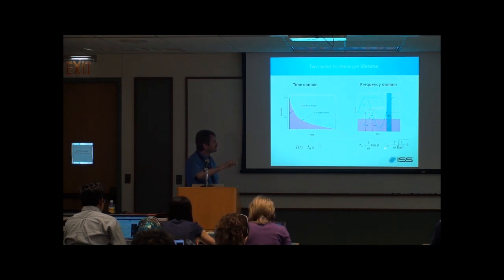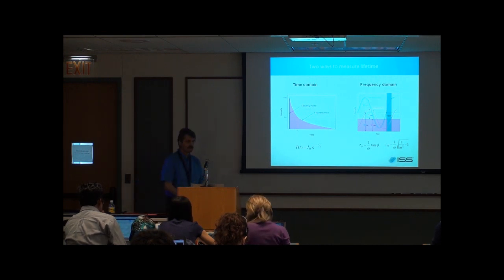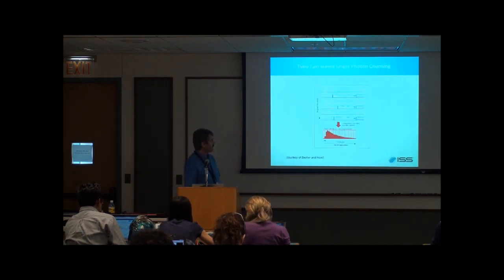And both are related to the lifetime using these formulas. And this is for a single exponential decay. Now, this is a representation of the time domain.